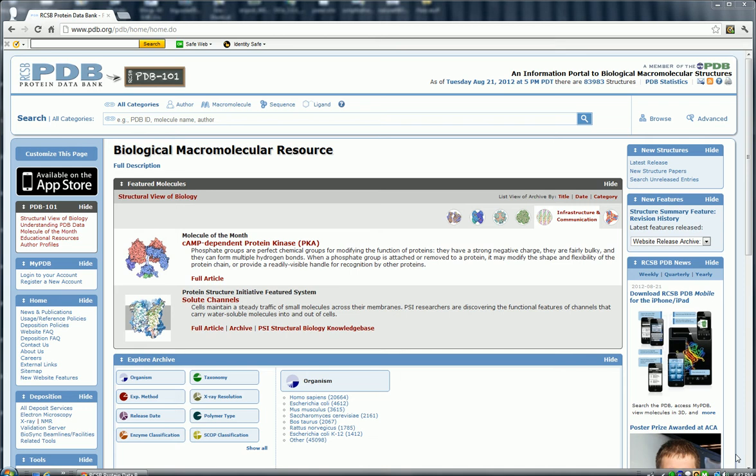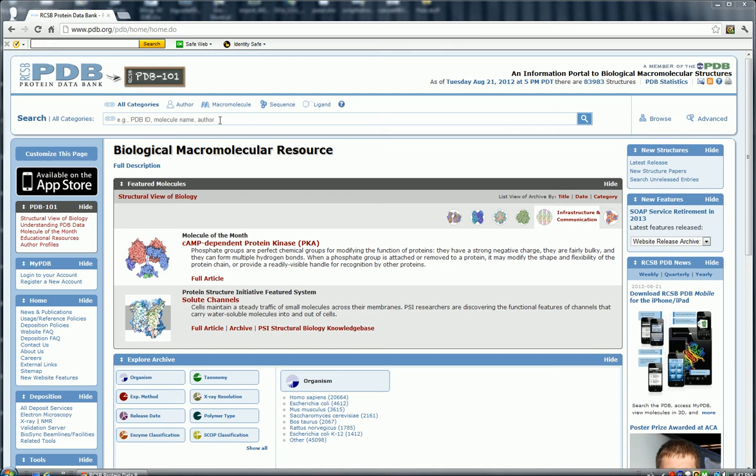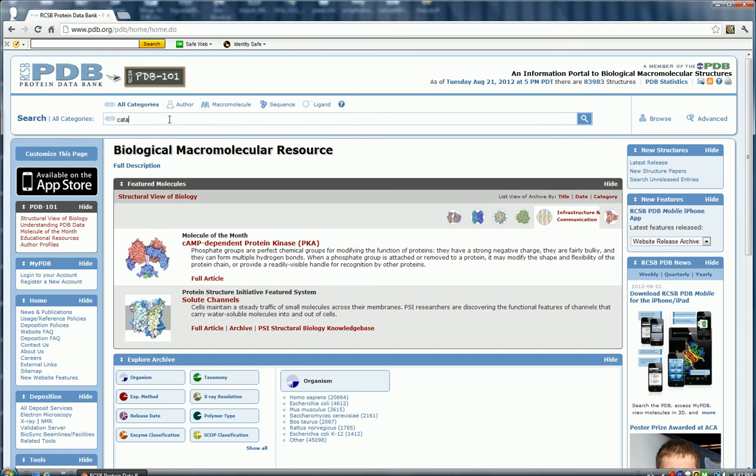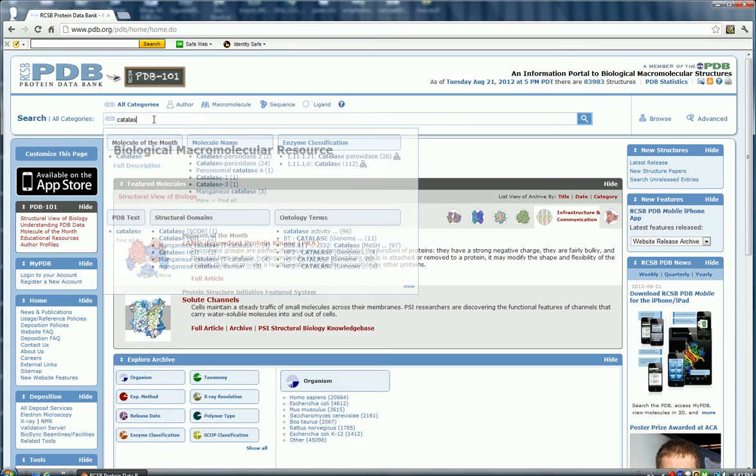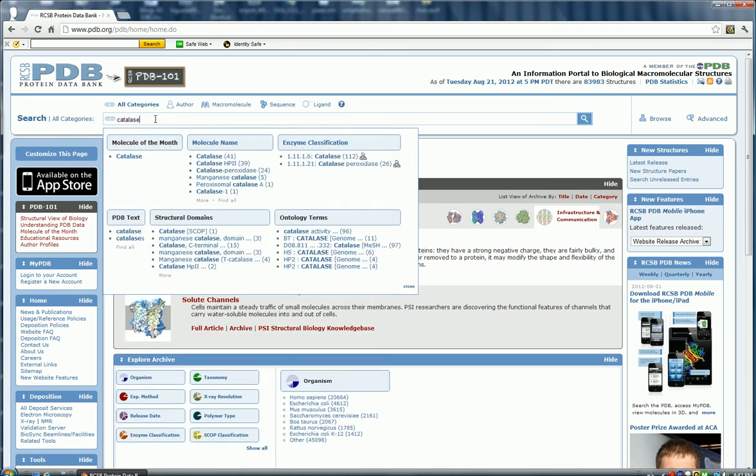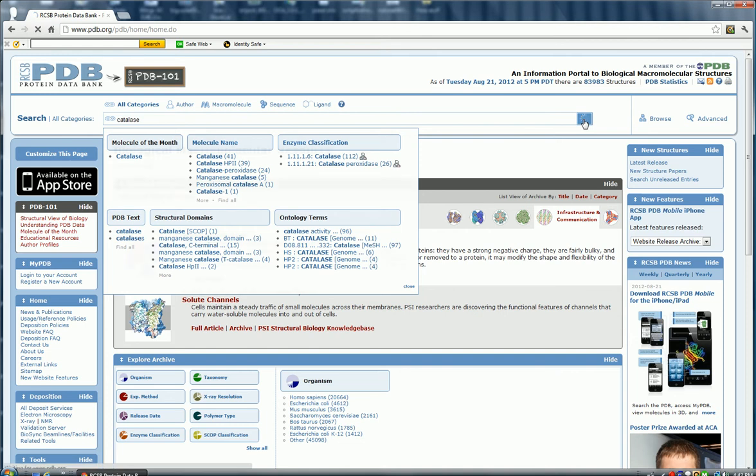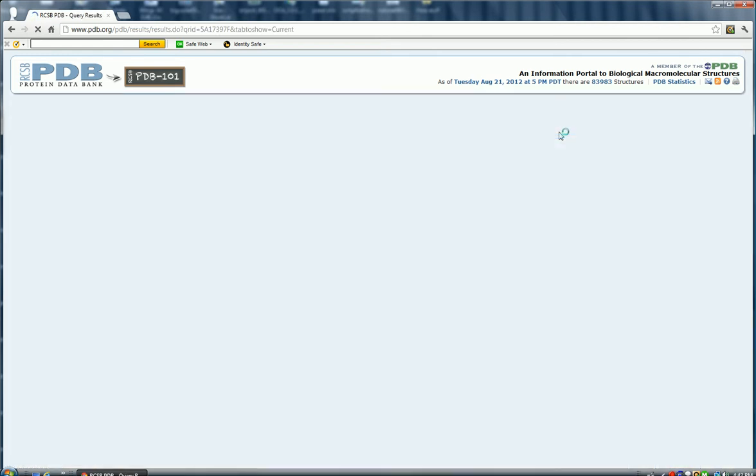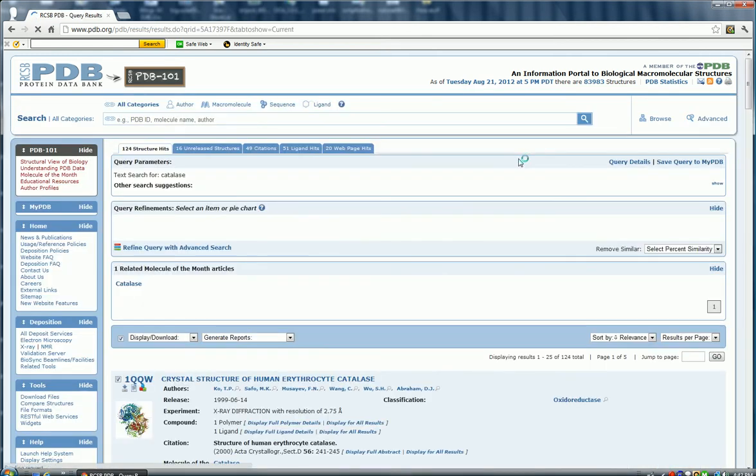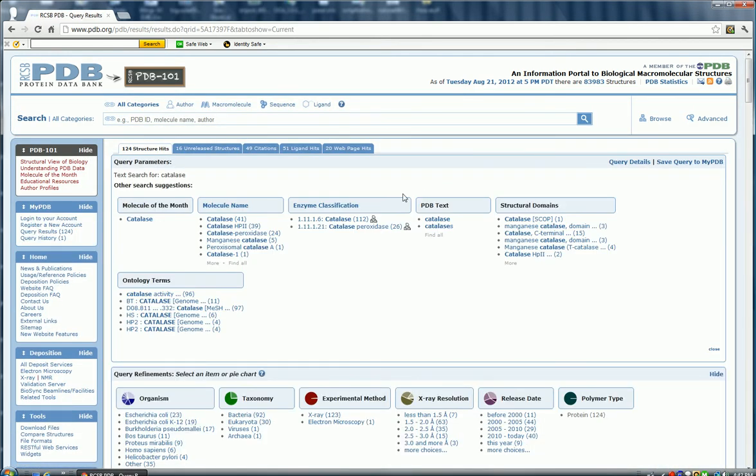So what I'm going to do first of all is search for a particular protein, so I'm going to go up to the search window, and I'm going to search for catalase, so I'm going to type in C-A-T-A-L-A-S-E, and hit the little magnifying glass, and we are in luck because catalase was one of the molecules of the month on this particular website.